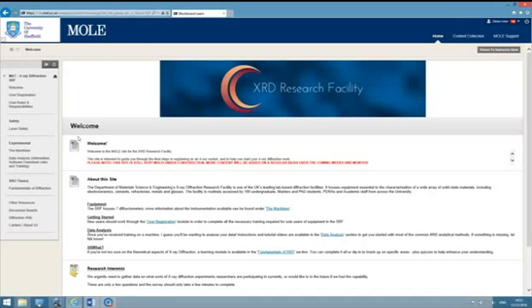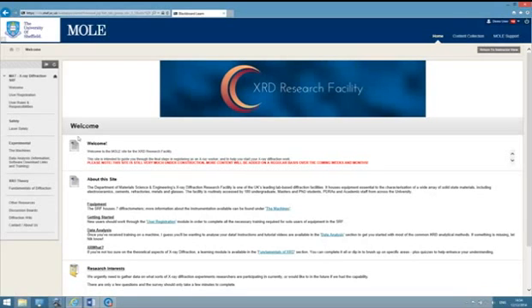The software comes with the Crystallography Open Database. This is an open access database — you can already access it online for free, but with this software it can be built directly into DIFFRAC EVA. It has over 300,000 entries as of October 2014, and they are looking to grow this quite rapidly to in excess of a million within the next few years. It focuses mainly on small molecule and small to medium sized unit cell crystallographic structures.